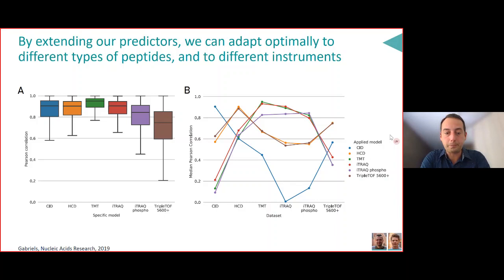Yeah. So a related question also on these topics: would you still expect the issues you described with TMT if one was acquiring TMT using SPS MS3, where the MS2 is giving you the peptide sequence info and the MS3 the quantification? Well, yes, I don't know, there's more explanation in there, but yeah, the MS3 step essentially is a really great step to try and get a clear noise-free signal from the TMT label.